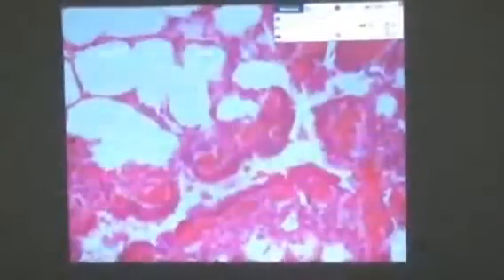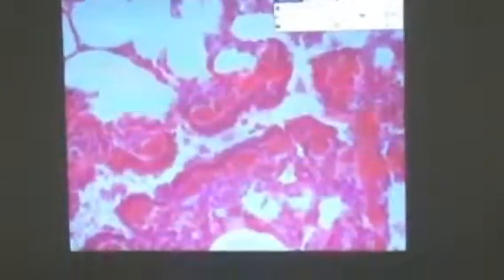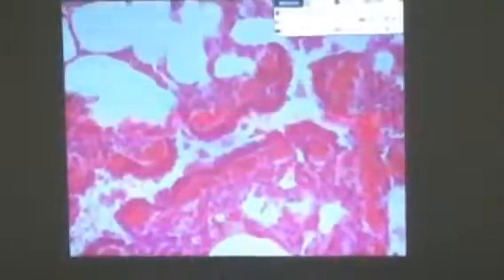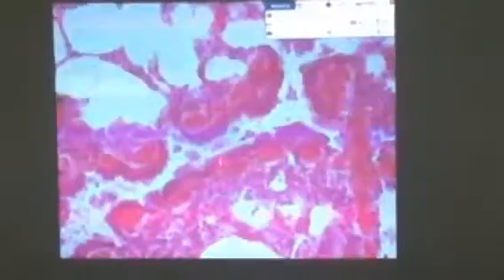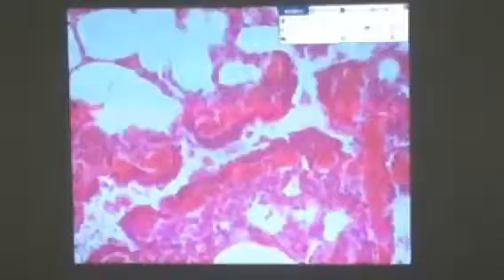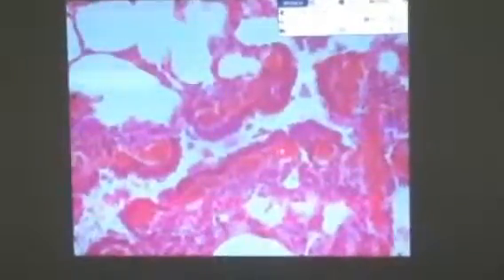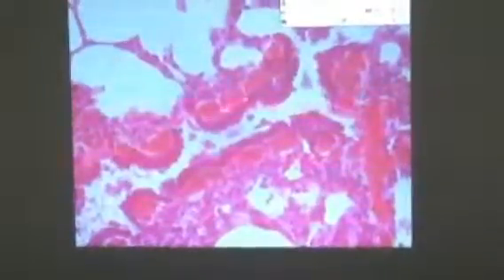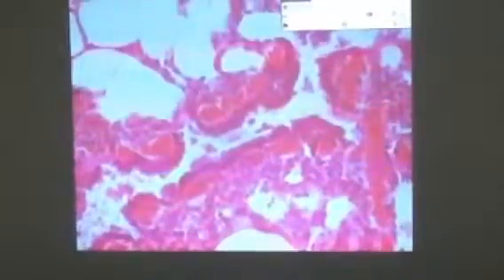So the components of the wall will still be the same with that of the terminal bronchiole. The lining epithelium, however, will be purely simple columnar to cuboidal. There is no more stratification at this level of the respiratory tract. Then those pointed tissues are smooth muscle fibers. And then the outermost layer will still be called lamina propria. Outermost? Ay, sorry, adventitia.